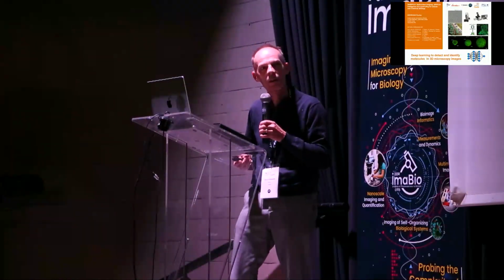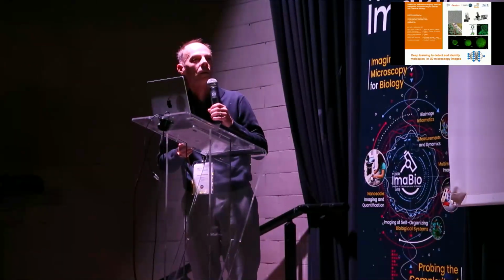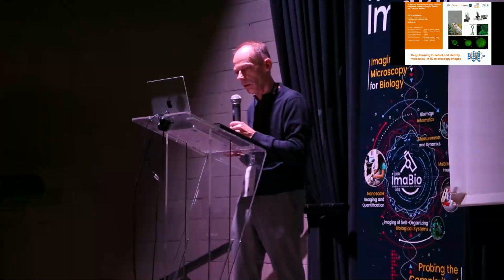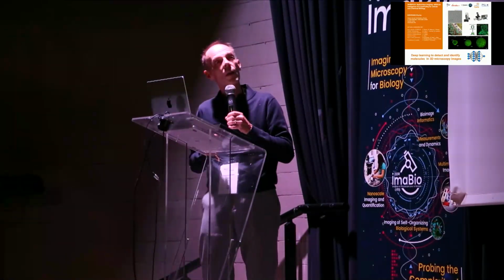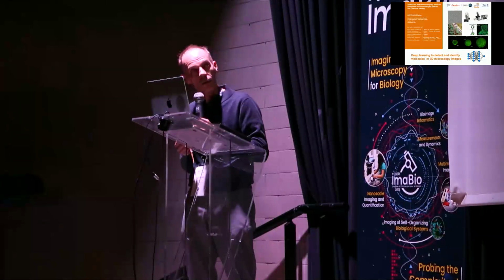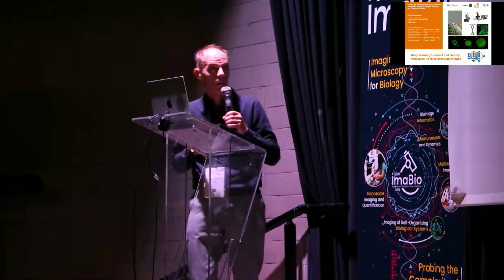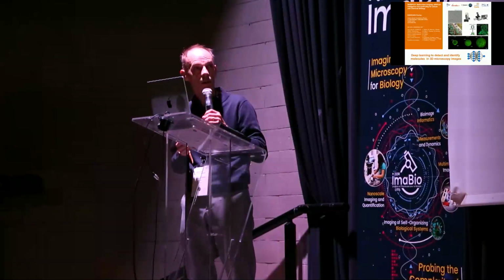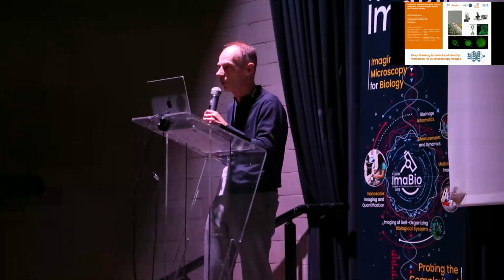In this talk, I'm going to show you an approach based on deep learning to detect and segment 3D images. I will focus on two typical projects. First, we will study images acquired with a very sophisticated microscope in cryo-electron tomography.